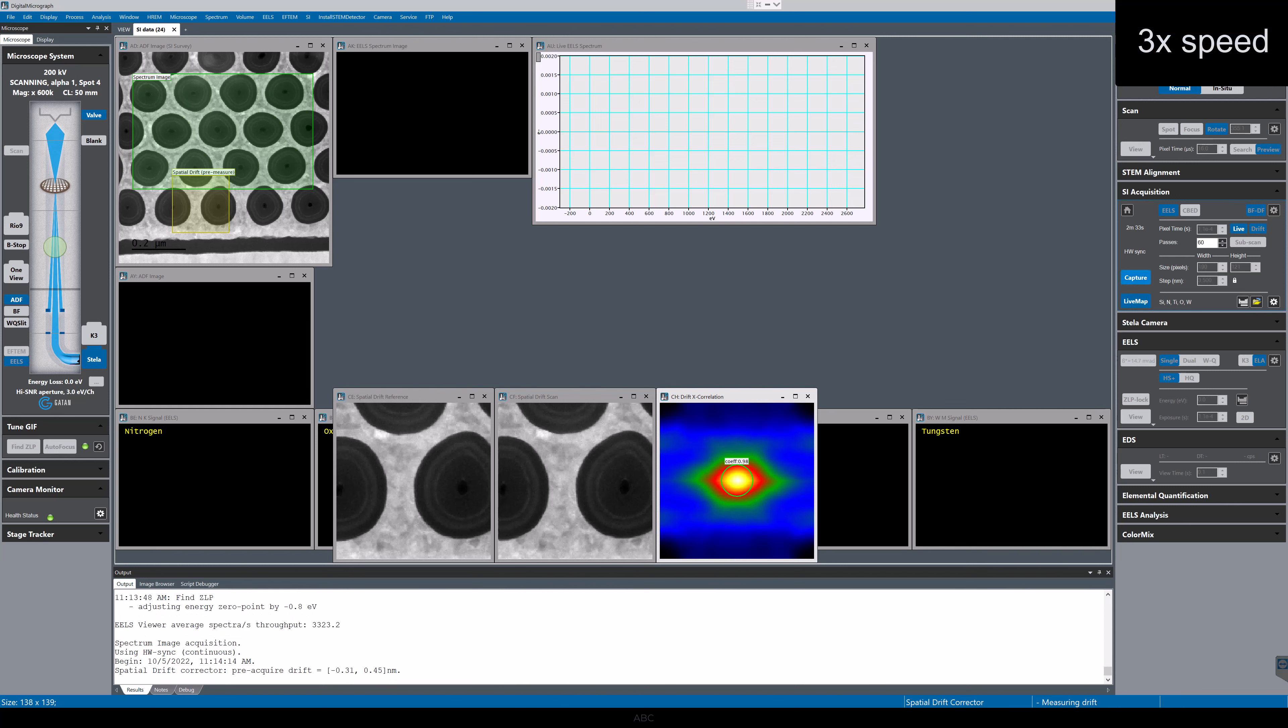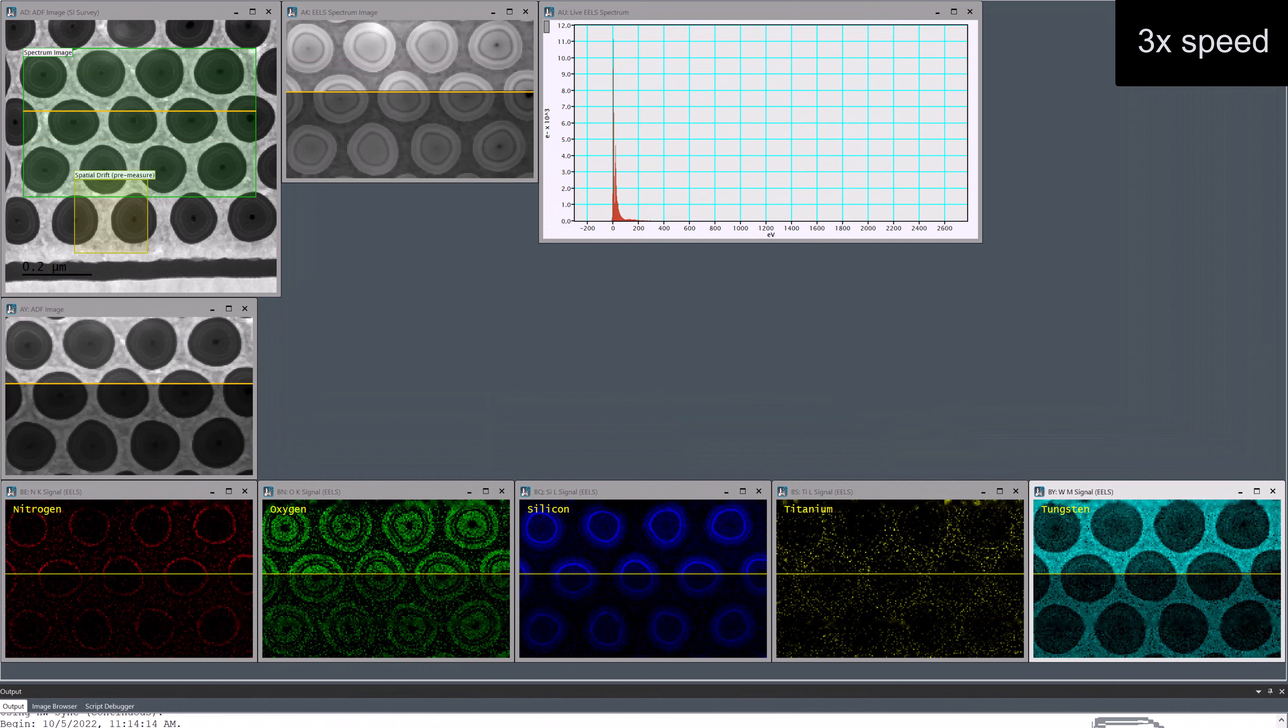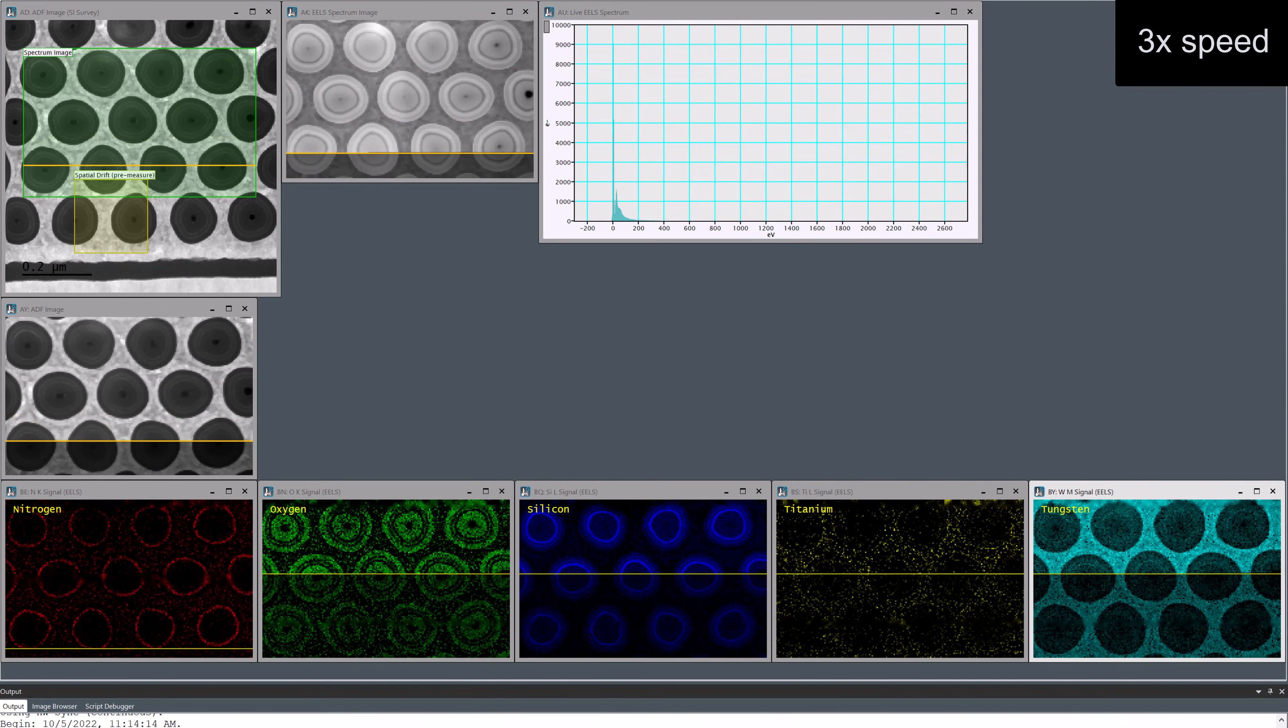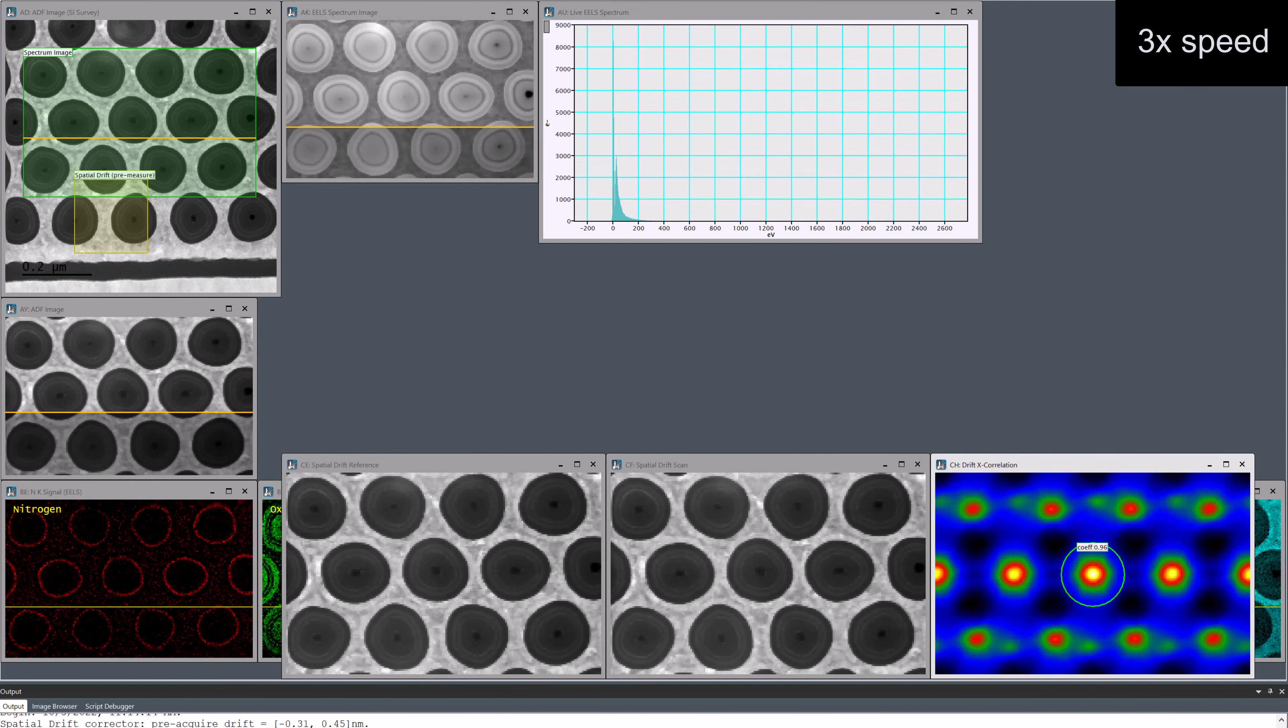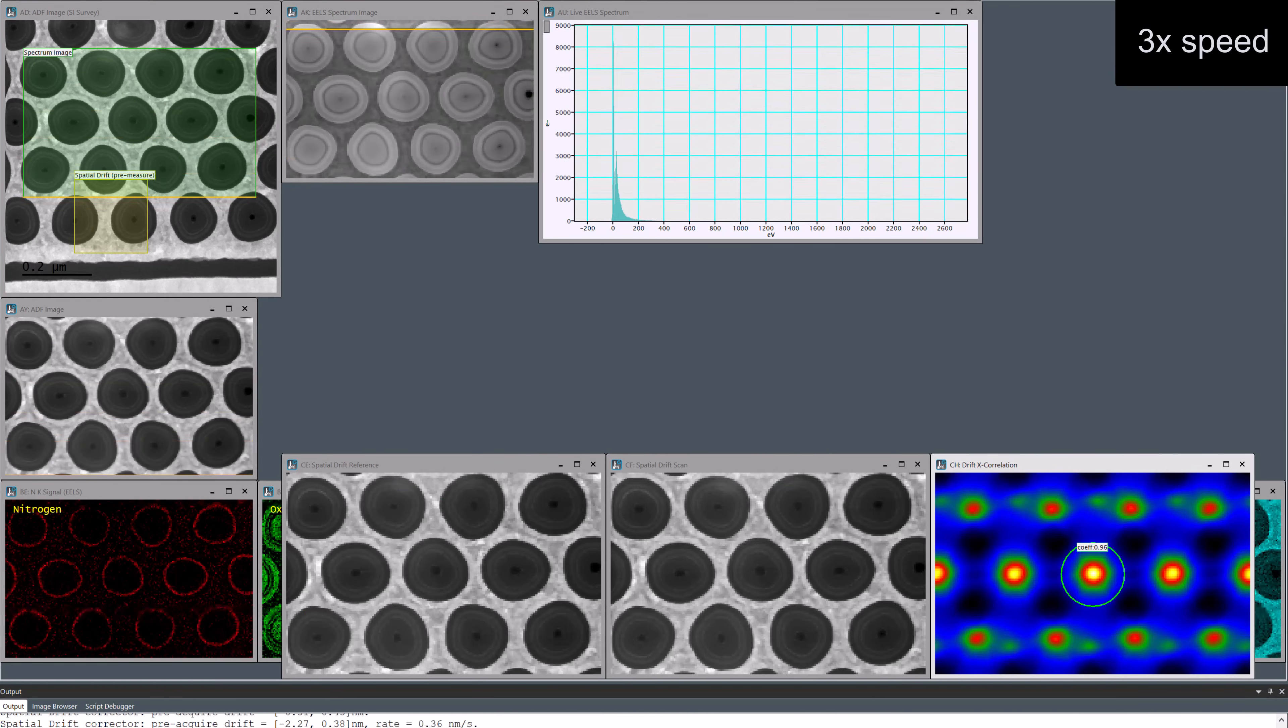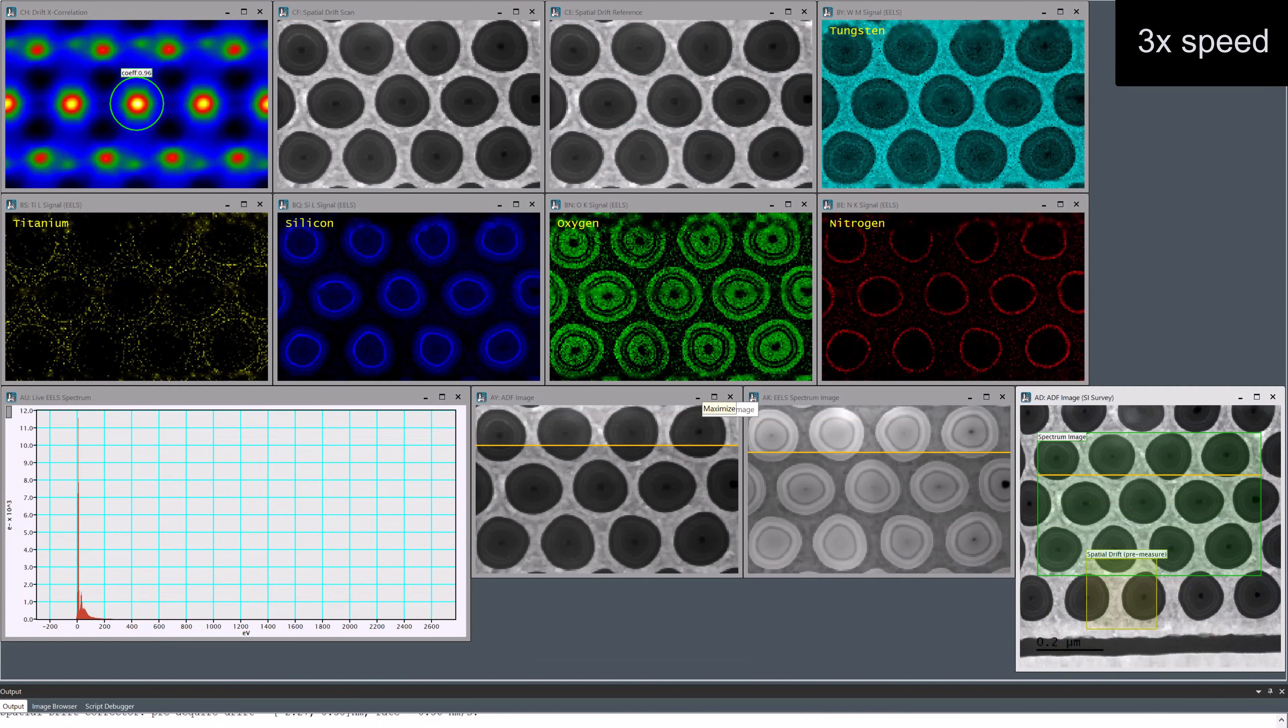I'm collecting 60 passes of data in this experiment. EELS data and the simultaneous ADF signal are being acquired at 9000 pixels per second.